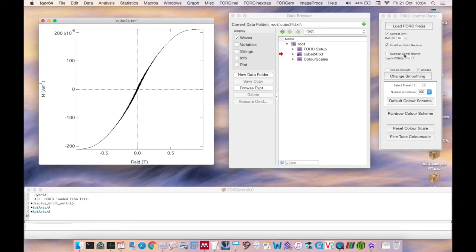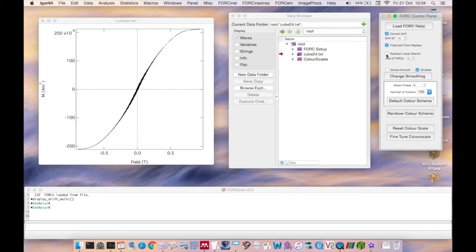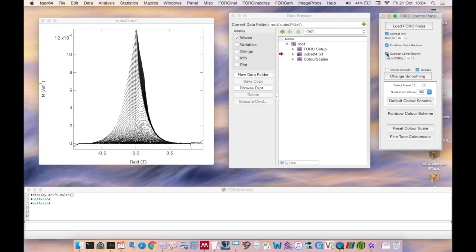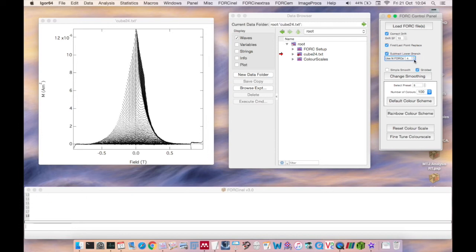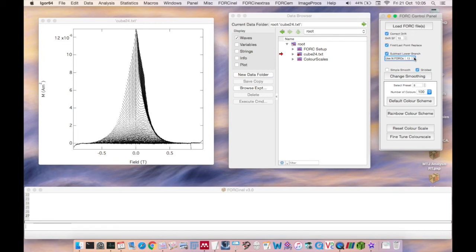The final pretreatment option you have is the subtract lower branch option. This makes an estimate of the lower branch of the hysteresis loop and then subtracts that lower branch from all of the fork curves. The estimate of the lower branch is obtained using locally weighted regression to fit a smooth curve through the last n forks in your measurement. And the value of n can be specified here in the fork control panel. Using a larger value of n will reduce noise in the lower branch estimate. Too large a value, however, and the curve will stray too far from a good estimate of the lower branch.